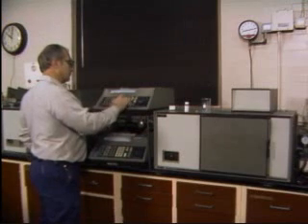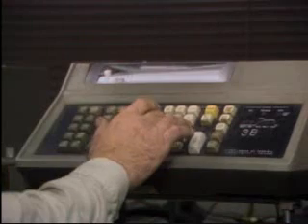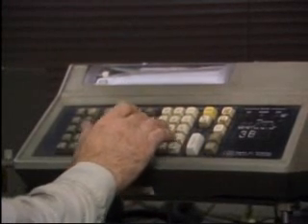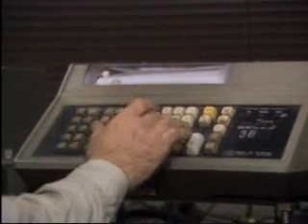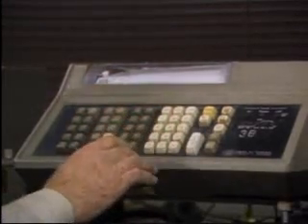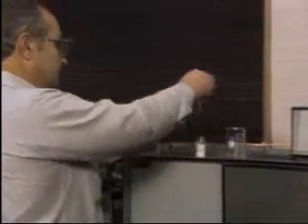Before the gas chromatograph is used to test a sample, it must be calibrated or standardized. The procedures used to standardize a gas chromatograph are specific to the instrument being used, so be sure to check the manufacturer's instructions for your gas chromatograph. Once the gas chromatograph has been standardized, it can be used to accurately measure the concentrations of the components in the sample.